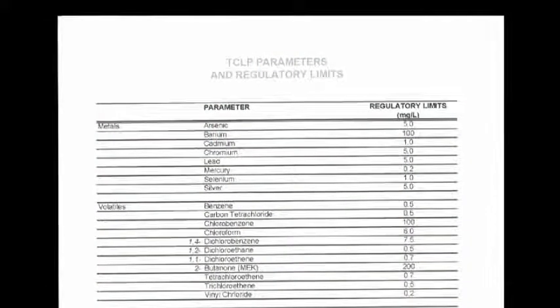Over time, water and other liquids percolate through landfills, and if they absorb contaminants, this liquid leachate may pose public health and environmental risks. The TCLP test determines which of certain contaminants identified by the Environmental Protection Agency would be present in the leachate. If the concentrations present meet or exceed the regulatory limit listed on this chart, the waste becomes classified as hazardous waste. Therefore, it must be properly treated and disposed of.